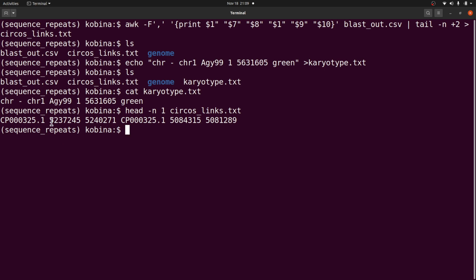I'm going to replace all occurrences of this with this value here, using sed. I have my text file, this is the content. But with this text file, I want to replace all these accession IDs with this, all the occurrences. So wherever you see this, we are going to replace it with this one here. We are using the Linux utility called sed. To replace text in a file, you say sed. Now -i means that we are going to overwrite this text file. We don't want to save the output to a different file, but keep it here. So I'll bring a single quote.